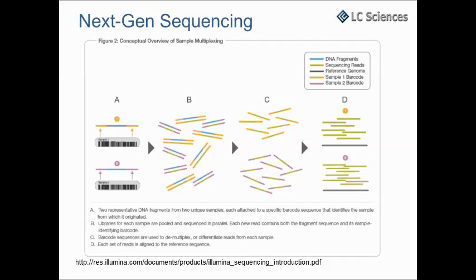After parallel sequencing, we get multiple reads, and based on the barcodes we assign the reads to different samples according to the previous assignment of the barcodes. Then the reads are sorted together into one sample, another sample.